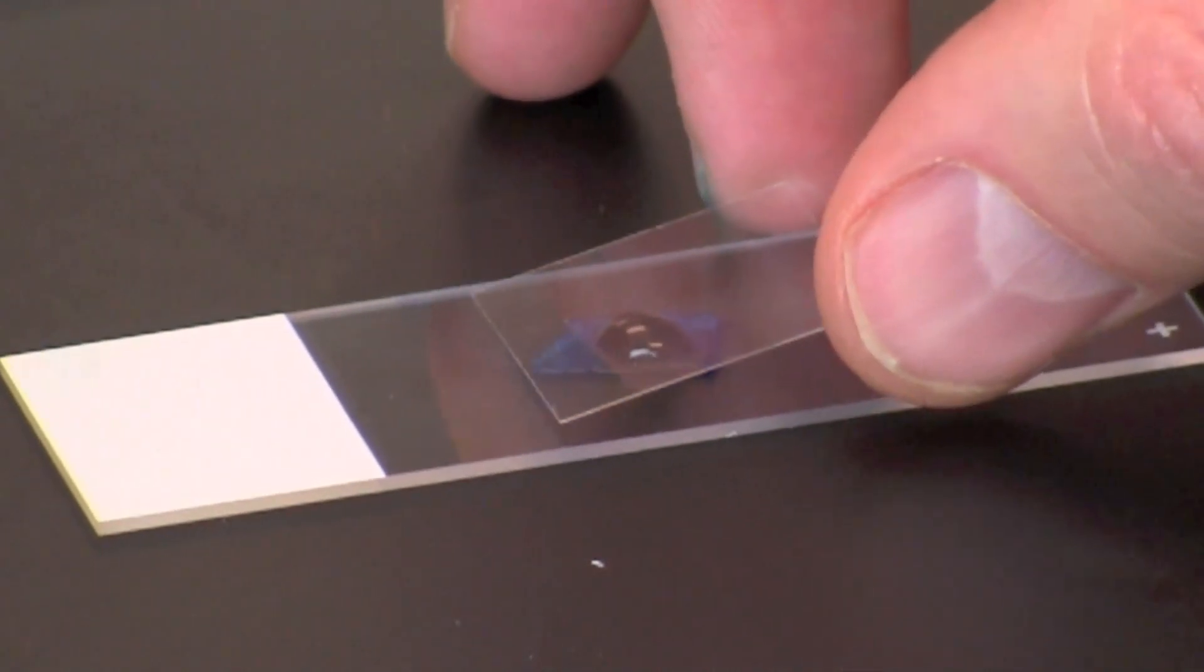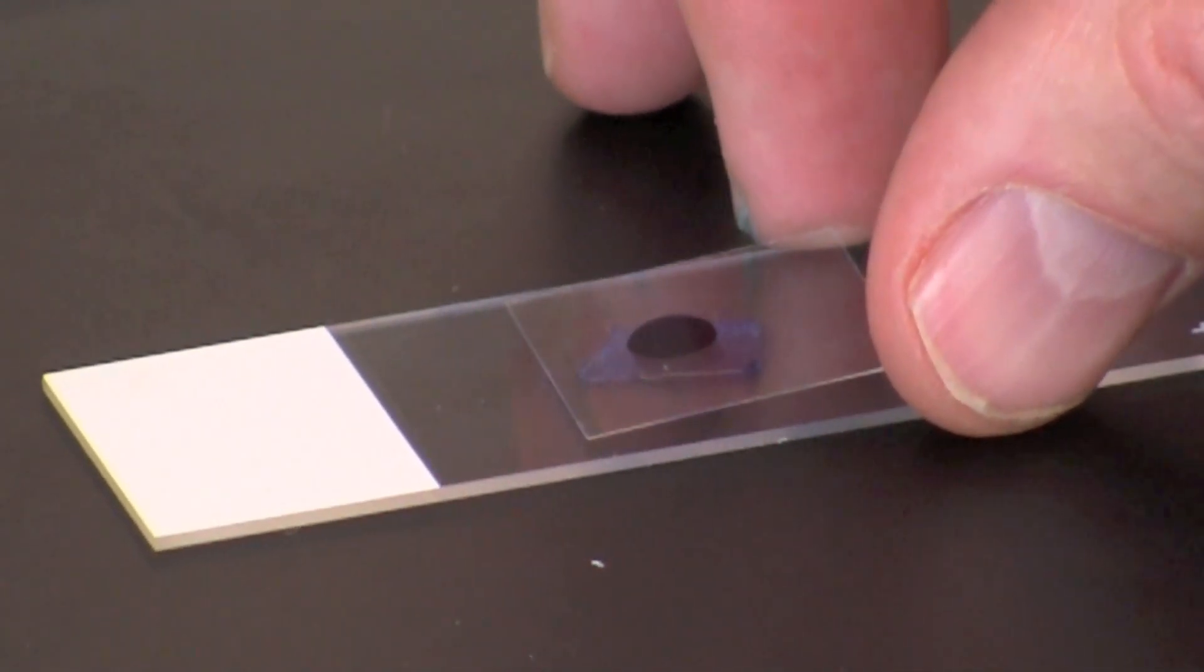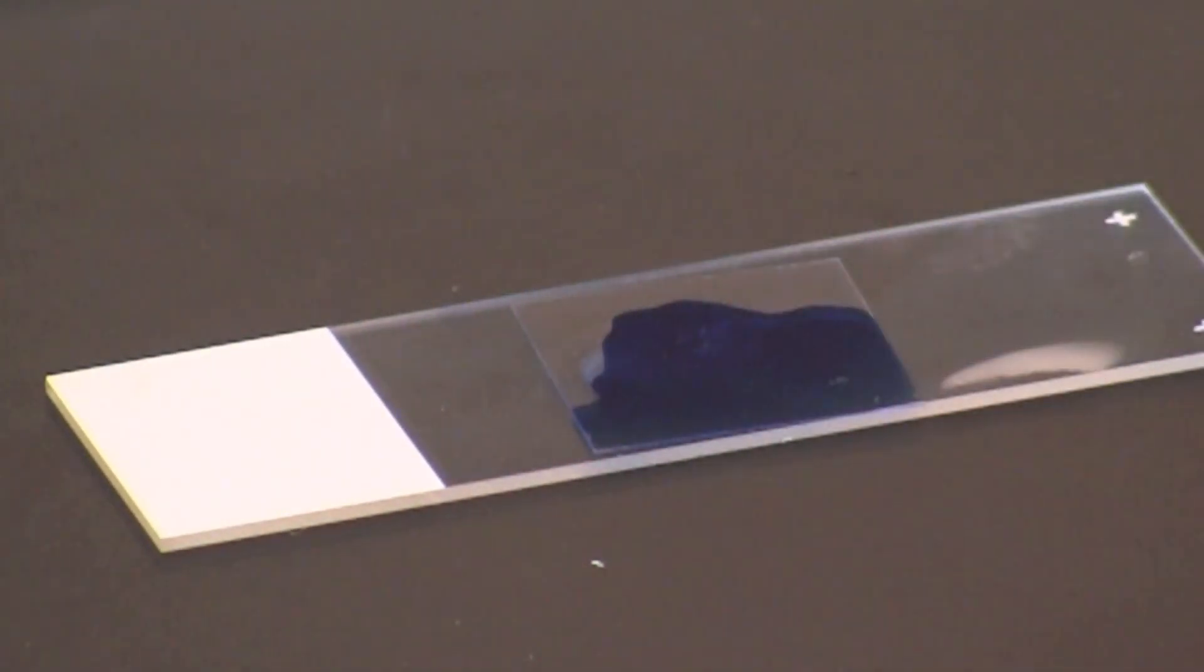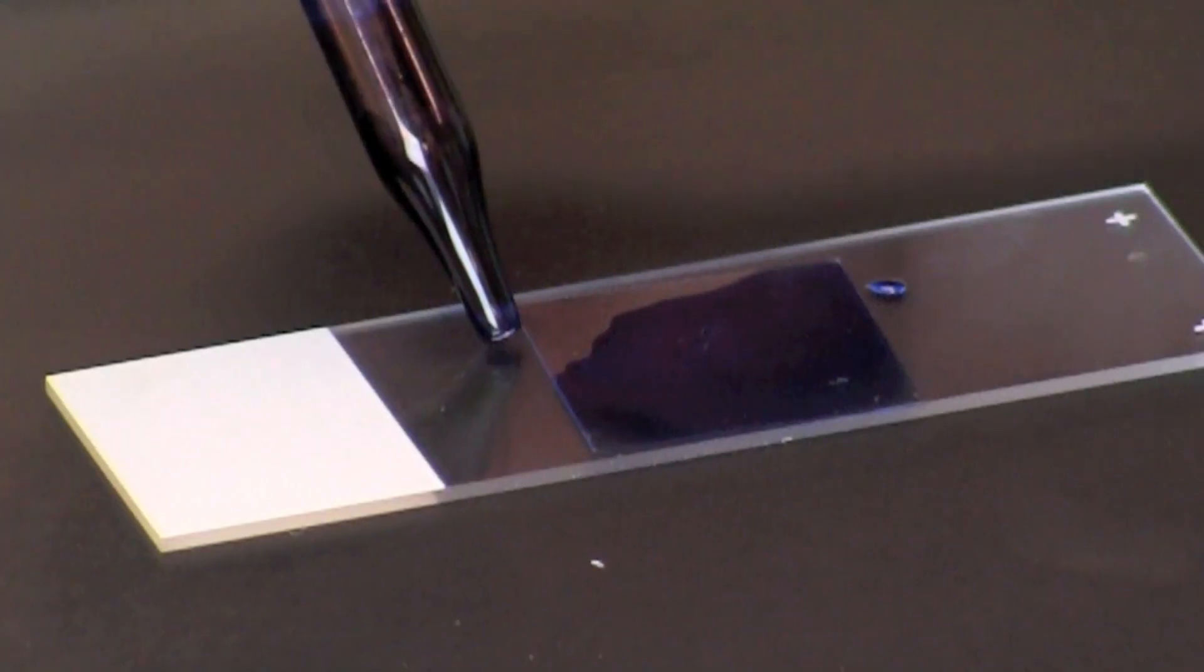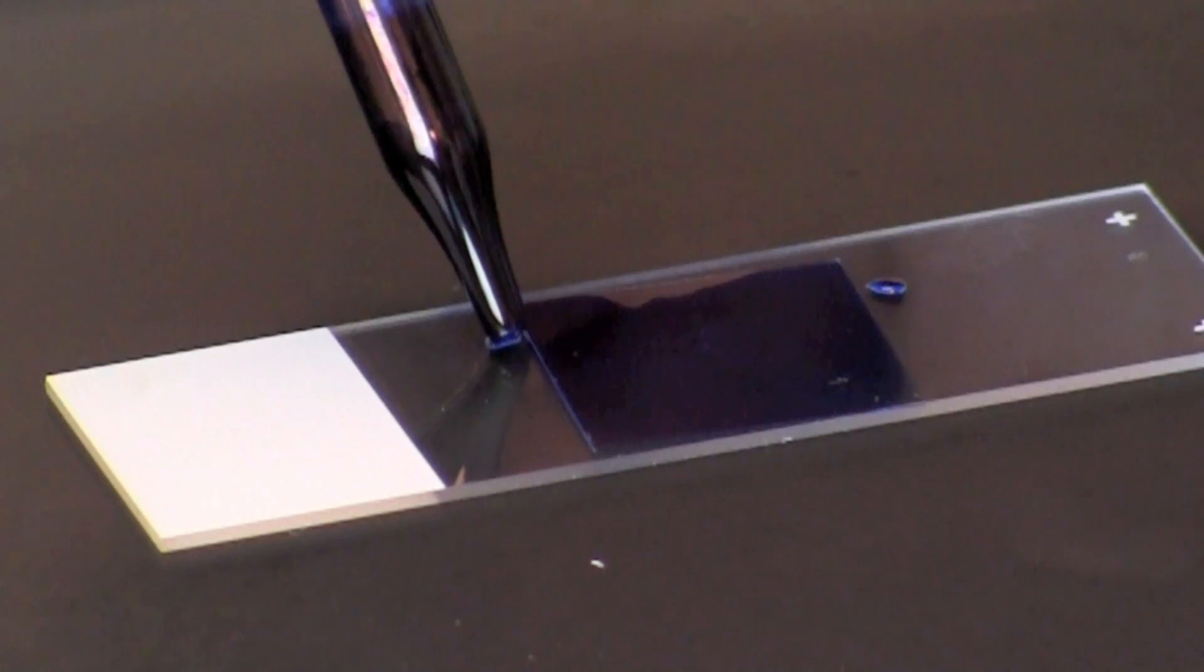Prepare the wet mount by lowering a coverslip over the stain, starting at a 45 degree angle. If a bubble forms under the slide, additional stain may be added along the side of the coverslip.